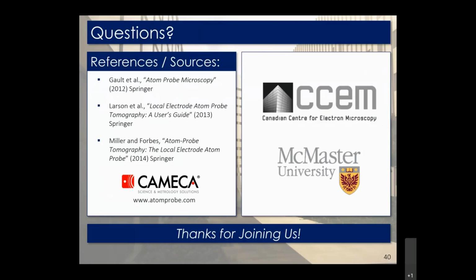So it's relatively safe. But overall, you should be using the largest, most dominant element in your data to run that correction. So even if there is overlap, it should probably be minimal. Say if I'm running a steel and I'm using that iron peak, I would expect that even if I had significant overlap from something else, it's still going to be small compared to the amount of iron in there. But yeah, it should be safe. I hope that answered the question.